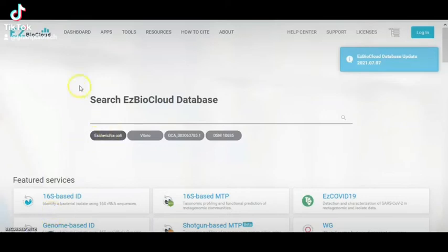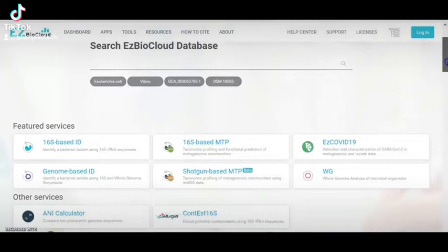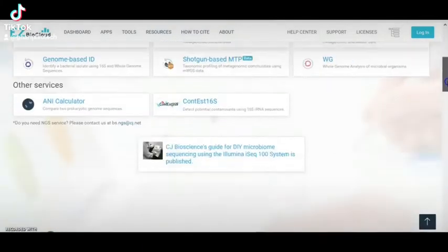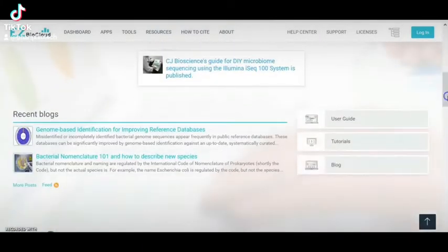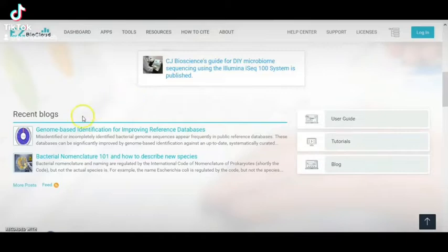Hello guys, today we'll talk about how to identify new bacteria. Here is a tutorial for using this server. This is a database — here we can see that we can navigate through it.